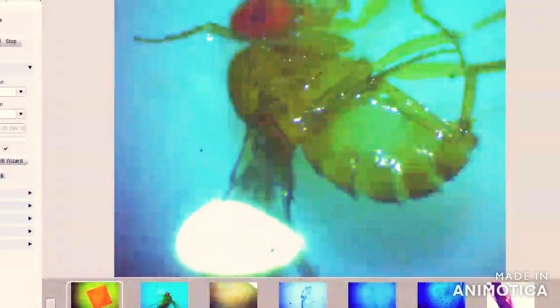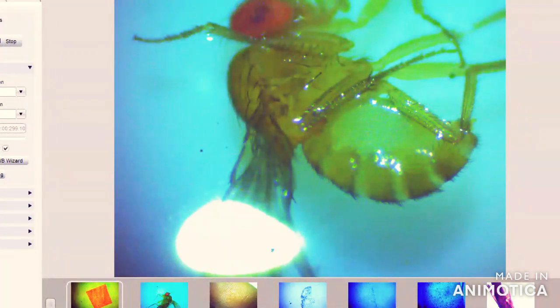Drosophila melanogaster is a species of fly often referred to as the fruit fly, or known as a vinegar fly or pharmacy fly. They normally prefer to eat yeast, corn, and the cell wall of red algae. They prefer to eat fruits like that.